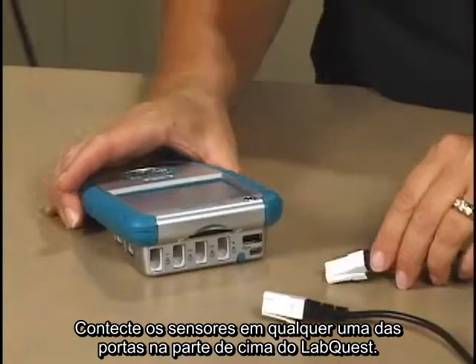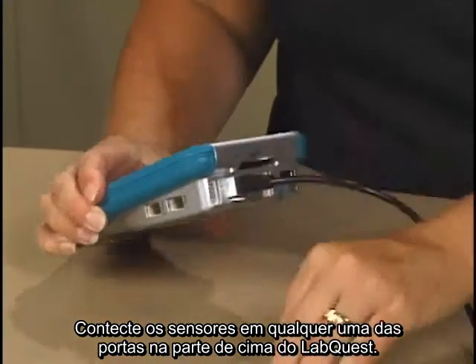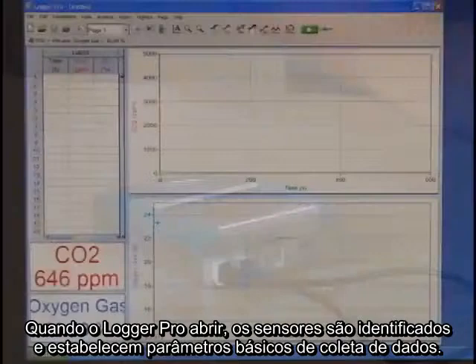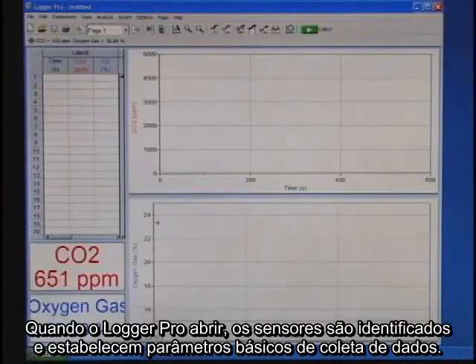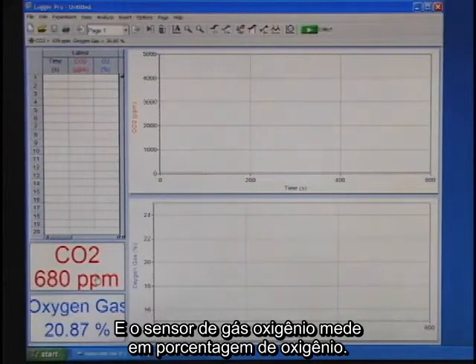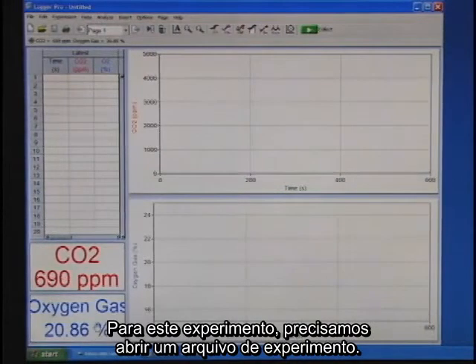Connect the sensors to any of the 4 ports on the top of LabQuest. When LoggerPro is opened, the sensors auto-ID and set up some default data collection parameters. Notice that the CO2 gas sensor is measuring in parts per million, and the oxygen gas sensor is measuring in % oxygen. For this particular experiment, we need to open an experiment file.